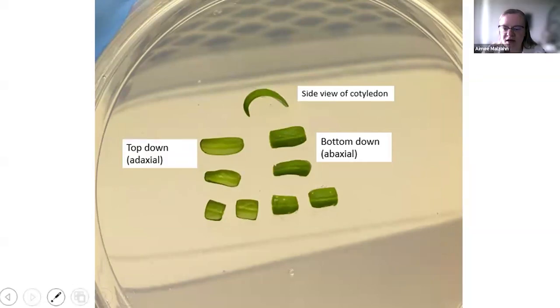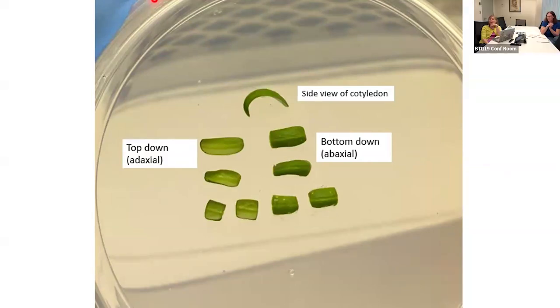Okay. And then I actually had a question for myself. I don't want to abuse my powers as the Zoom host here. But you had that slide earlier with transferring from the plates into the greenhouse. Are you using distilled water to water those plants at first, or do you just use the tap? Nope, just regular tap water.